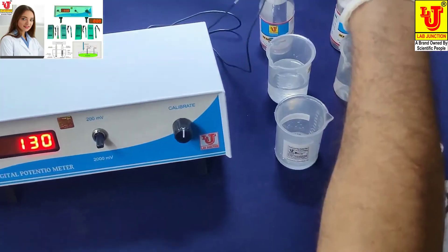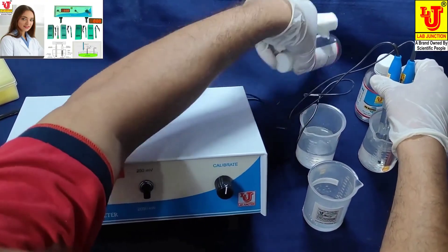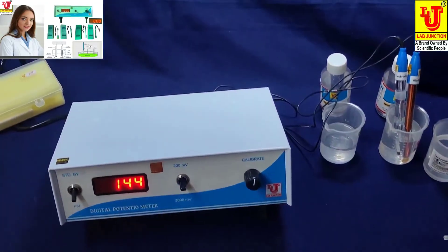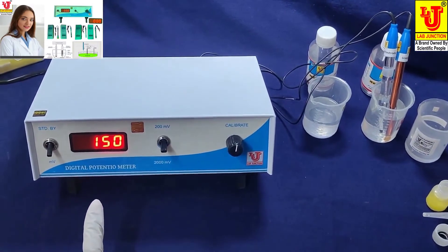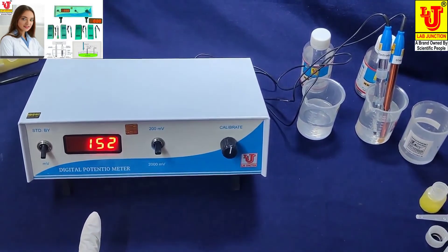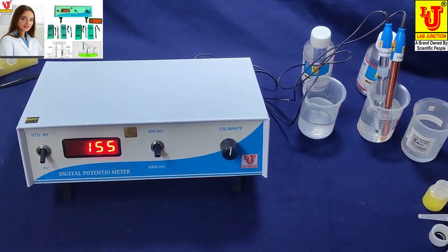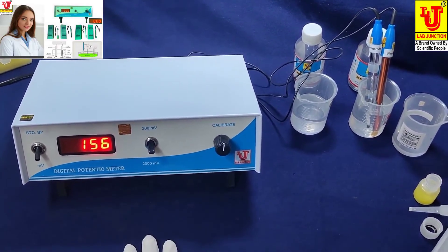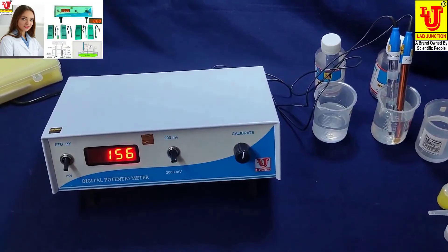Now I am cross-checking with pH buffer solution 4 pH to verify calibration. This is calibrated. As I mentioned, pH buffer solution 4 pH should read 140 to 200 millivolts. If your reading in 4 pH buffer is about 140 millivolts, your instrument is calibrated and ready for use.